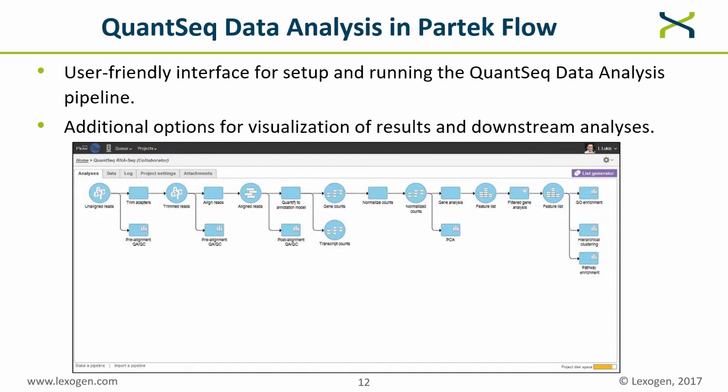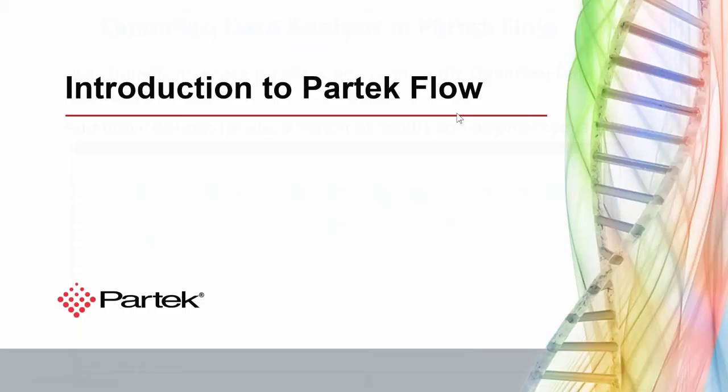All of the required steps of data analysis are performed with an easy-to-navigate interface, and Partek Flow also provides access to a range of options for visualizing the results of their experiments. I will now hand over to Ivan from Partek, who will take us through the use of Partek Flow for QuantSeq data analysis. Thank you, Stephanie, for this great presentation.